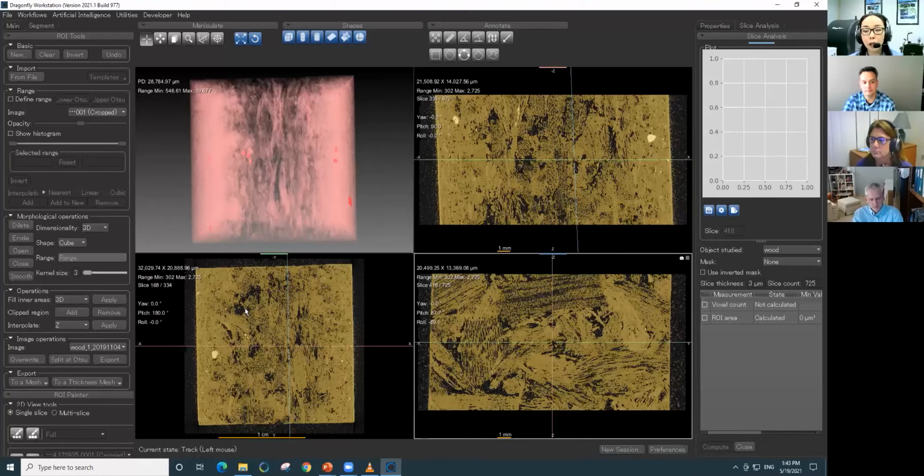In terms of how do we know if it's correct or not, ultimately, we're the judge of what's correct and what's not when it comes to image analysis. So if you agree with the result you're getting from machine learning, I would say that is correct. But if you look at the results and go, no, that's not how I would do it, or you're picking the wrong areas, then that is not correct. You have to change your parameters or training data.